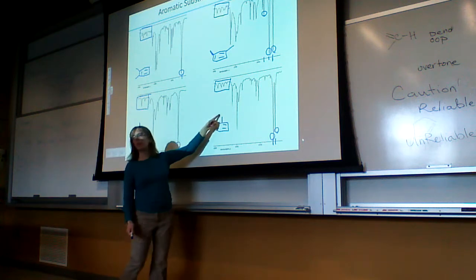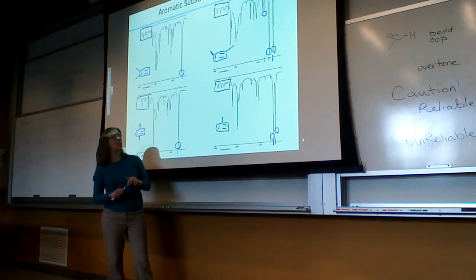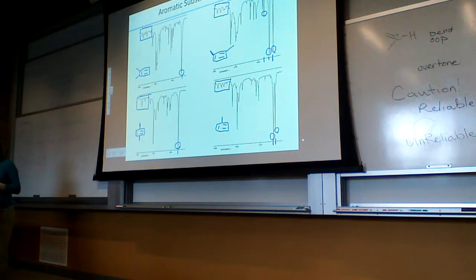So it ended up being a mono substitute with the same molecular formula, you wouldn't be able to tell directly. You would have to probably use some other type of spectroscopy to determine that. So you can narrow it down, but you may not be able to do the final assessment unless you can do a direct comparison to the actual spectrum.